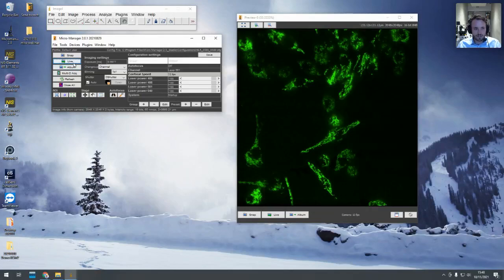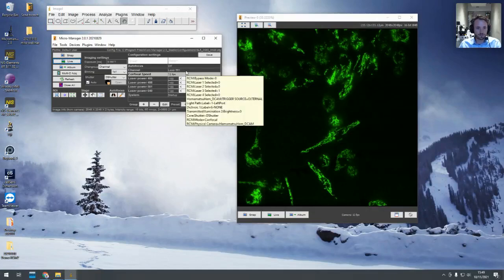So that is very nice. You have one platform to use all these different microscopes. In terms of user interface, very briefly, we have a snap button here just to get one image, or the live button to get a stream of images from the camera. And here under multi-D acquisition, we can do the more complicated experiments like Z-stacks, multicolor, and time lapses. And then here on the right-hand side, we see the buttons, so the operation of the NL5.